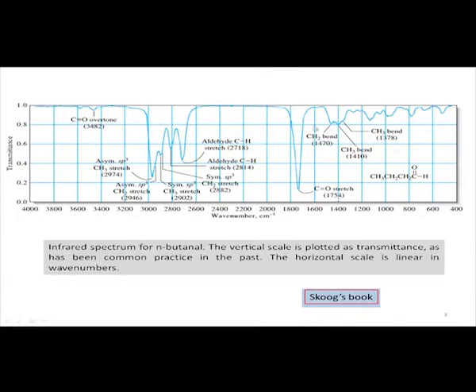Then we see that at these values which are not strong enough, that means your transmittance is of this particular magnitude, so your corresponding absorbance is also not very high. So, these are all bending modes. Bending modes all appear in this particular range of 1400 plus, one is at 1470, another is 1410 and another is 1378.